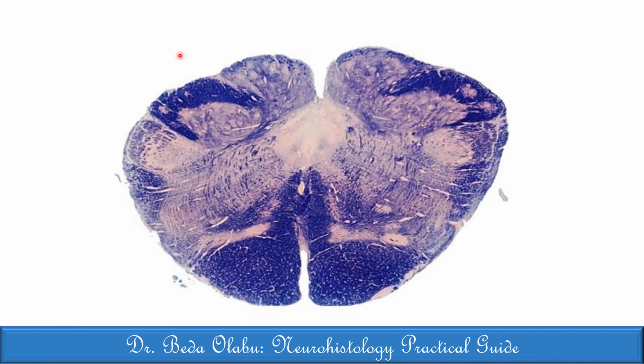Okay, let me try. The most distinctive feature is this, when we look at it anteriorly, it looks like this is a section of the medulla, and it's now closed medulla, I can say. Closed medulla, then we can see the periventricular gray matter around the ventricles, it's closed. Then anteriorly, the pyramids are distinct. Generally I can see the pyramids distinct.